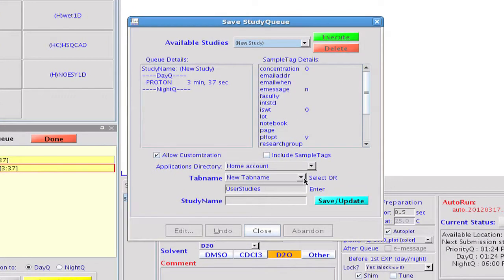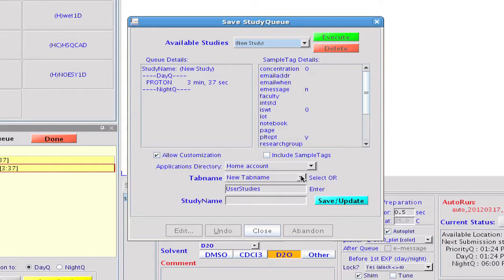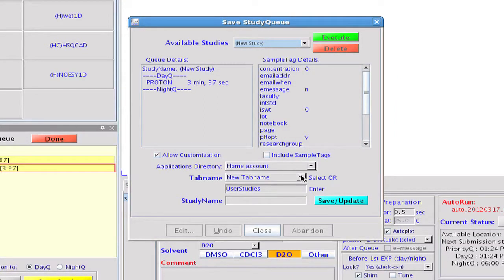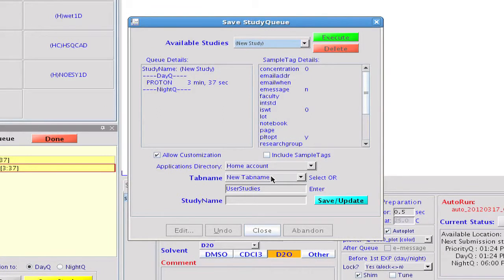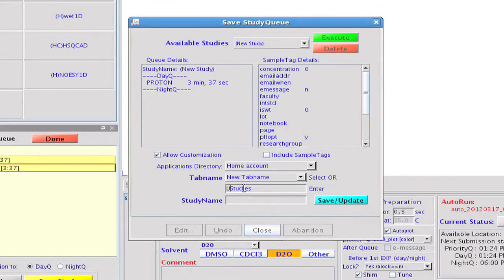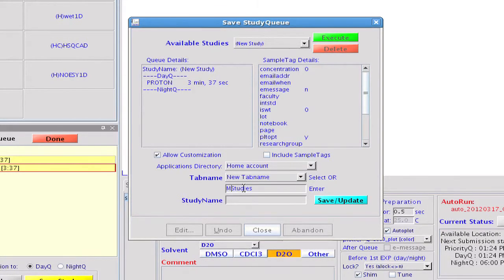Now when we select the save study button, we get the save study queue pop-up. This shows us that our queue consists of just the proton experiment that we've optimized and it presents us with the tools to add that experiment to the experiment selector as a new study.